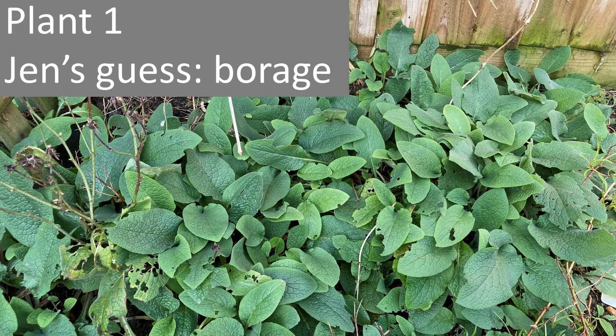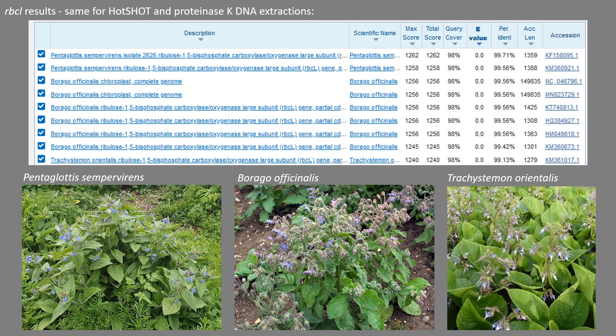Plant 1 — I thought it was borage that I picked a leaf from in my garden, and this was the RBCL result. The top result was for Pentaglottis sempervirens, the second was for Borago officinalis, and the third was Trachystemon orientalis — all from the borage family. I'm intrigued now because I did think it was Borago officinalis; however it could also be the top hit. I'm going to reserve judgment on that because without it flowering I couldn't actually be sure.